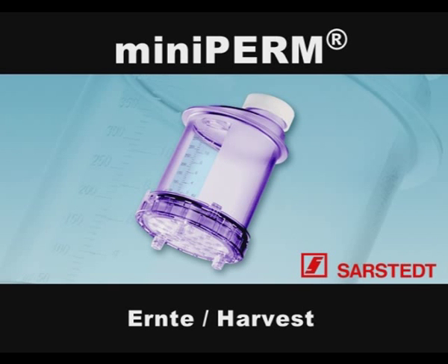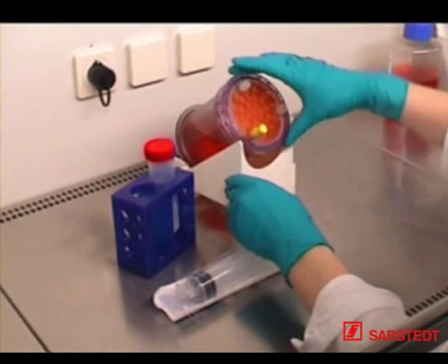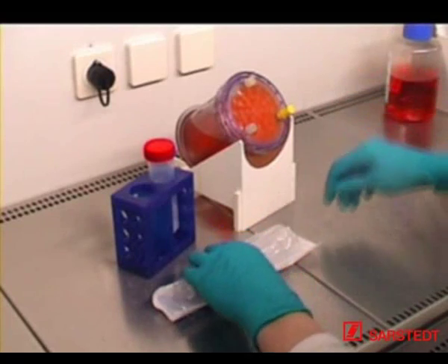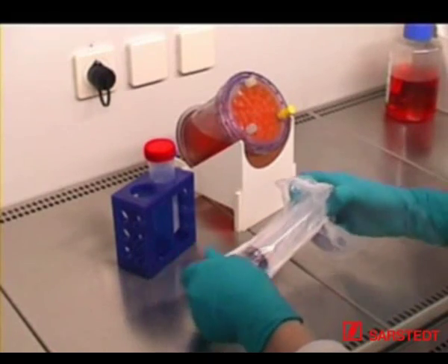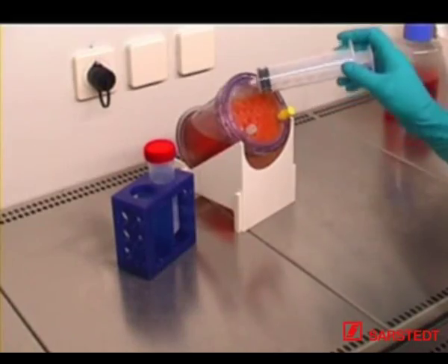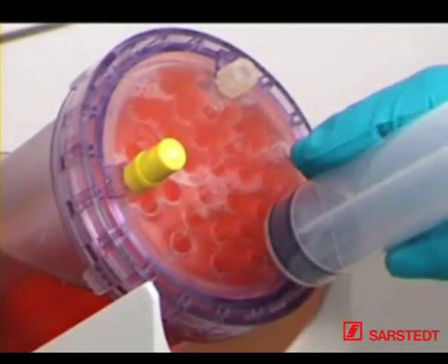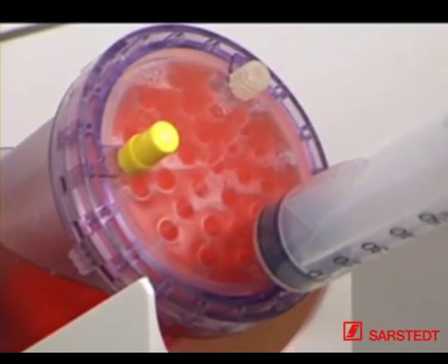MINI PERM harvesting. Harvesting intervals and volumes are determined by the cell density obtained as well as by the product delivered by the cells. As a rule, however, two thirds of the cell supernatant can be harvested once or twice a week. Place the MINI PERM bioreactor onto the rack with production module on top and rotate the unit so that one of the three openings is located at the uppermost position. Screw a sterile 50 ml luer lock syringe onto this port and rotate the bioreactor so that one of the two other openings is located at the uppermost position.